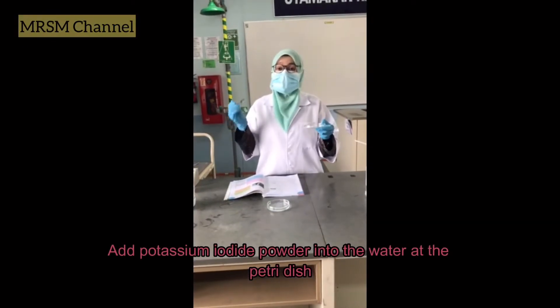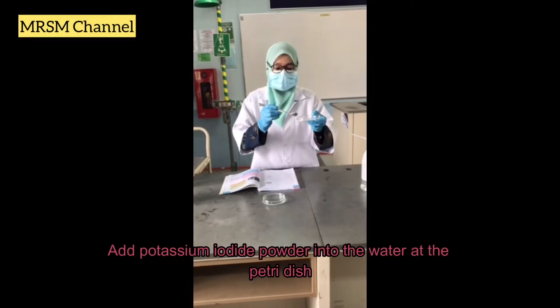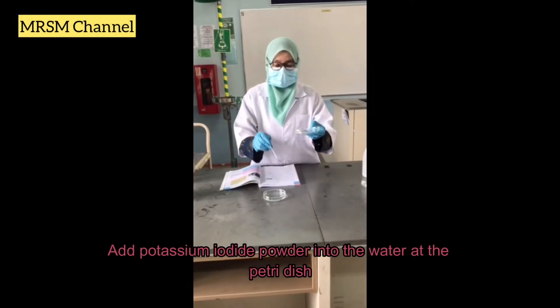For the third step, you have the potassium iodide powder here. What you should do is just put it at the edge of the petri dish.